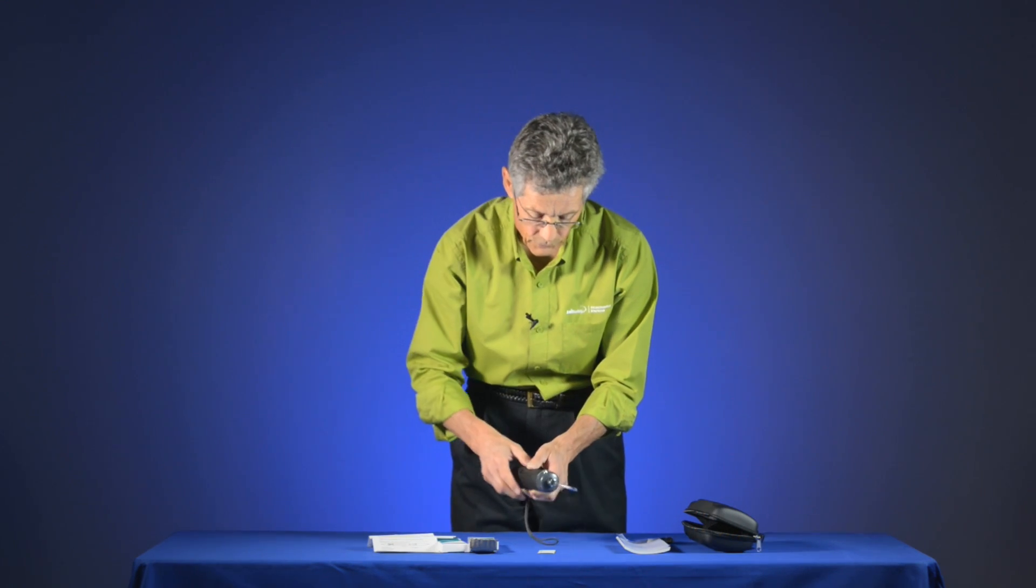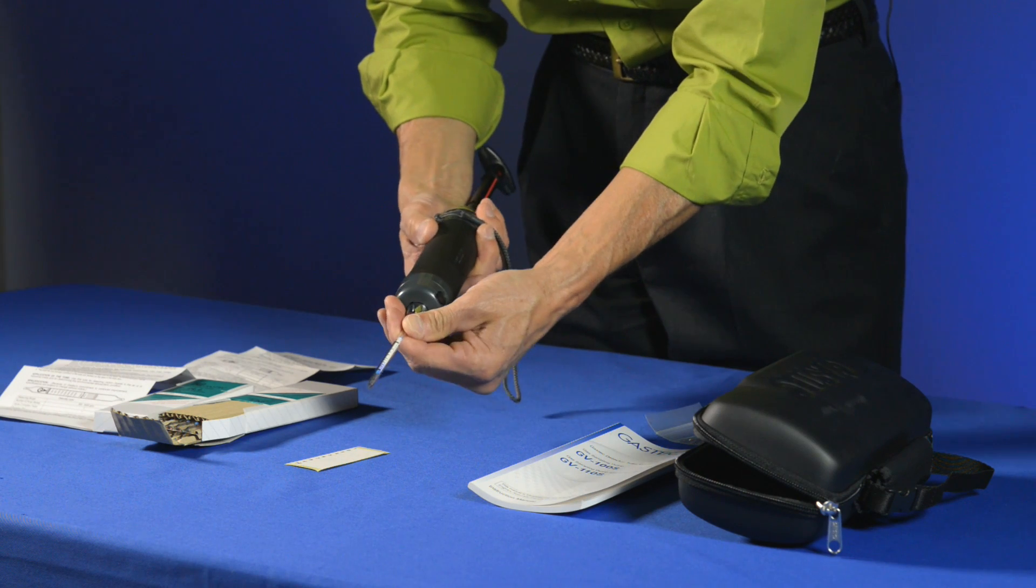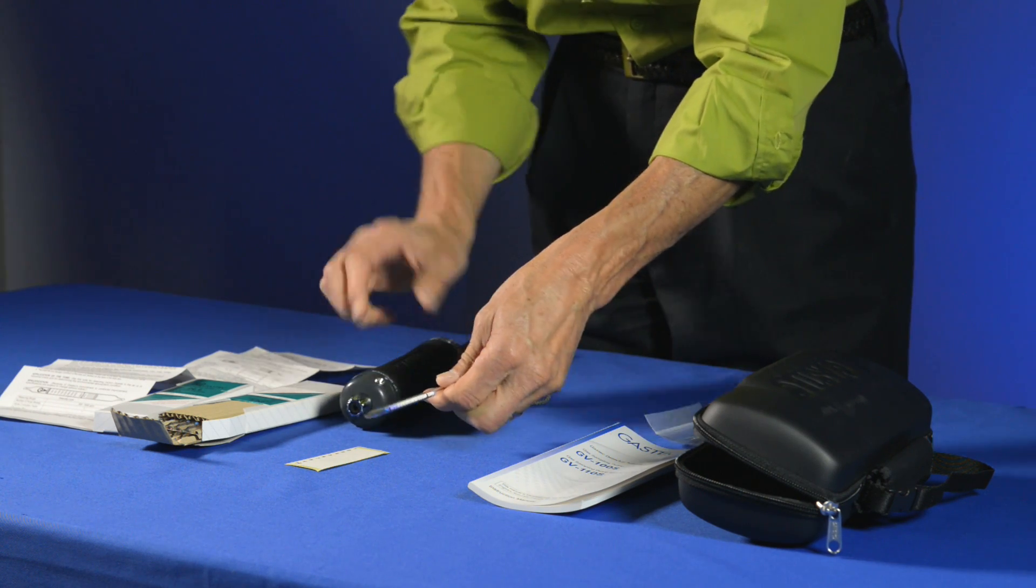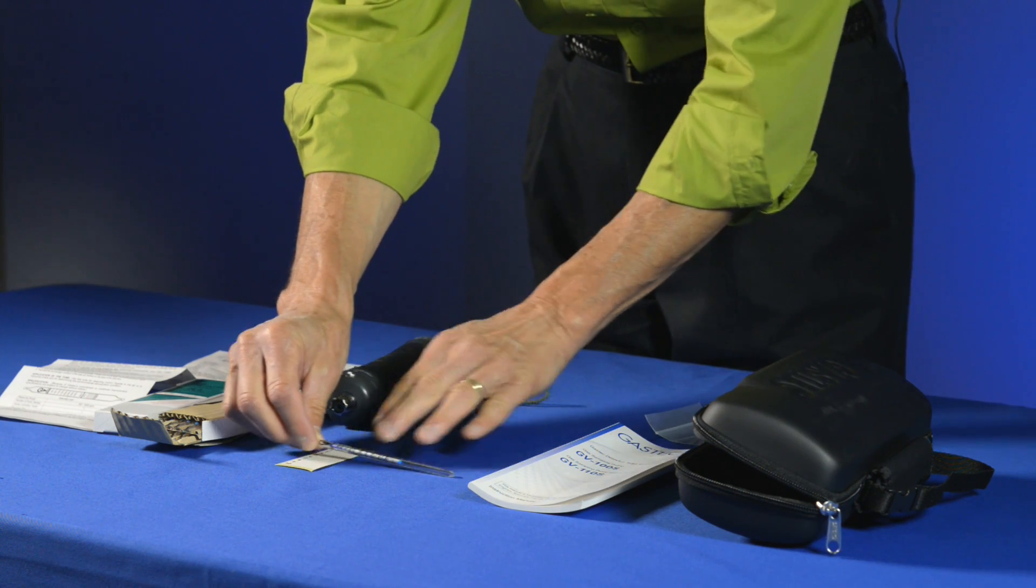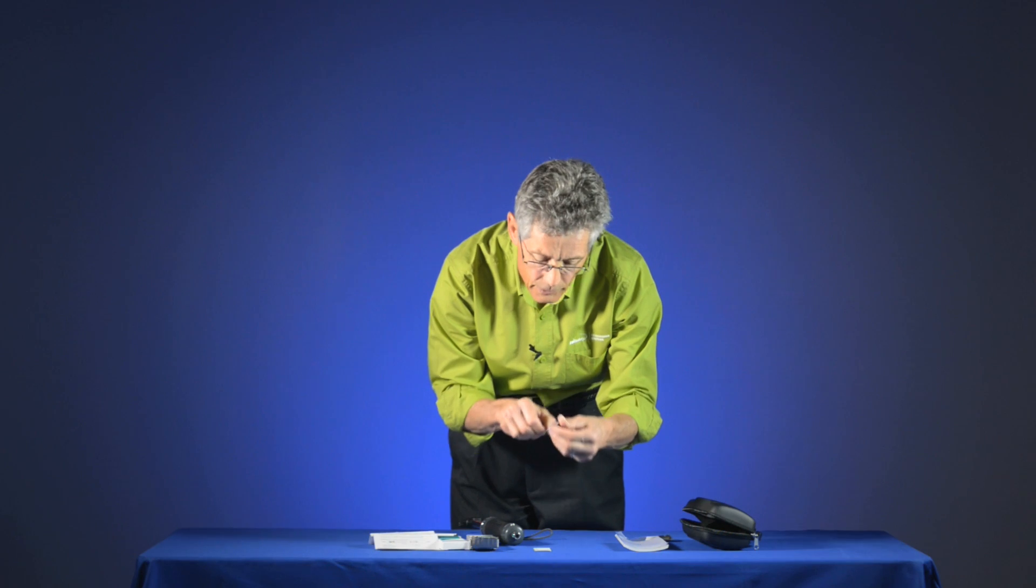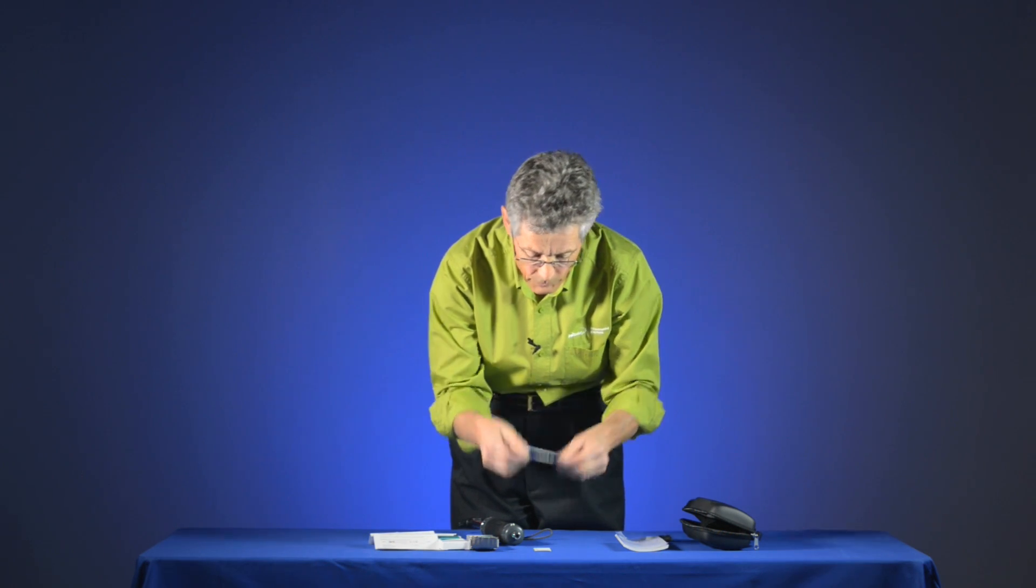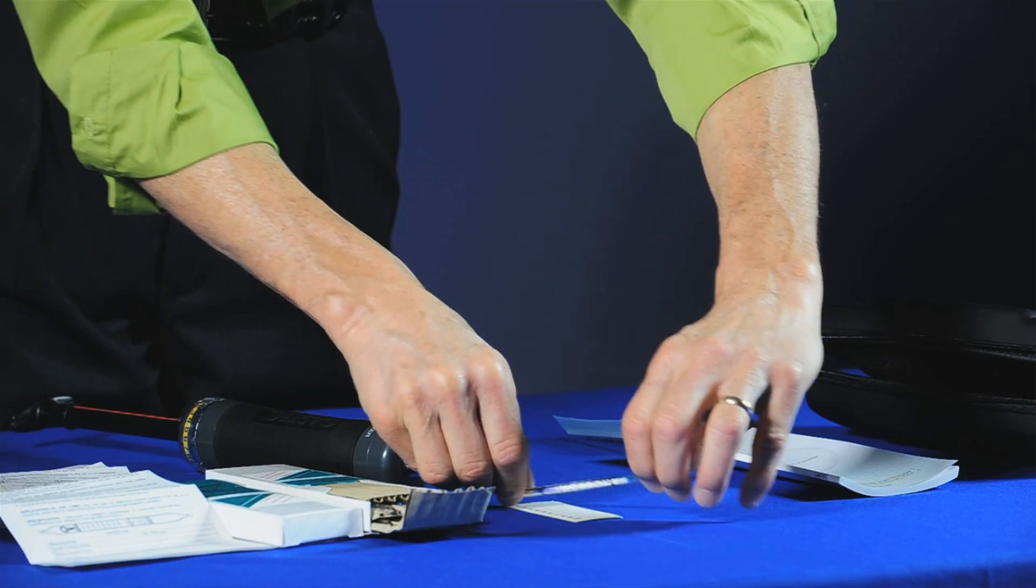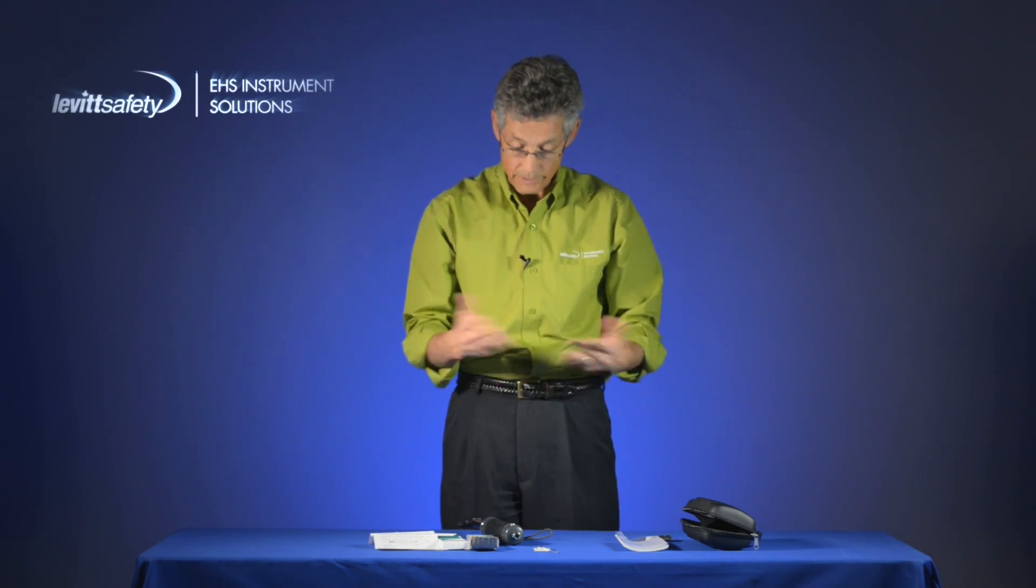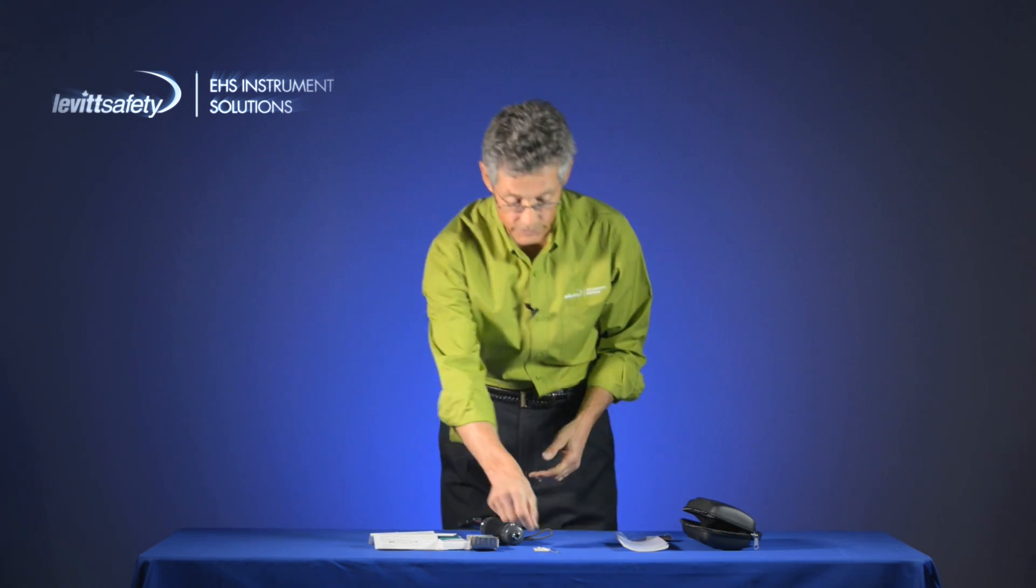So the pump stroke has been completed. I can take it out of the tube holder. And so my GasTech tube now reads a concentration of about 1,000 parts per million. So I know with confidence that the concentration of carbon dioxide is 1,000 parts per million right here and right now. And that's how you use the detector tube system.